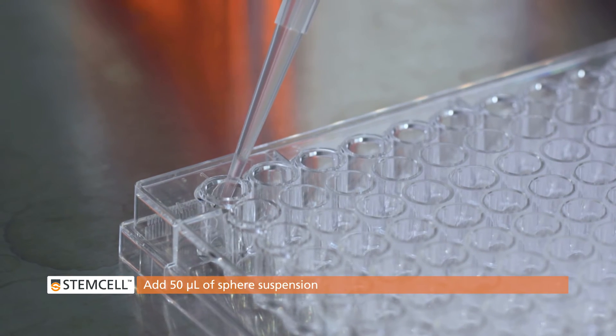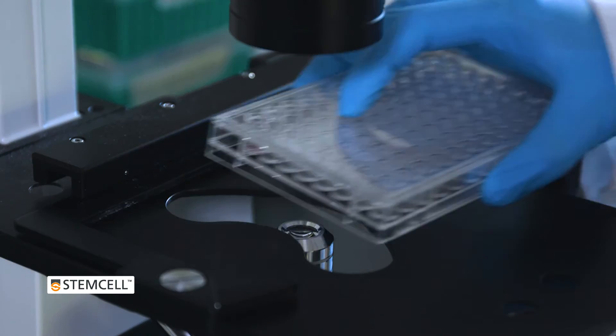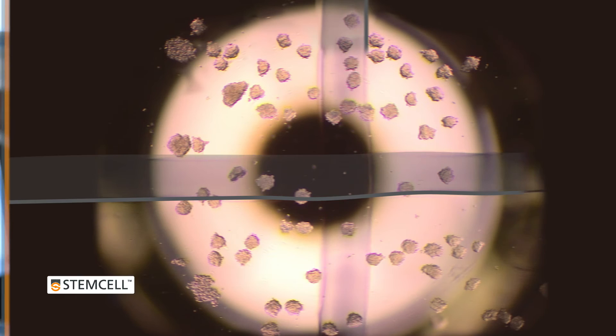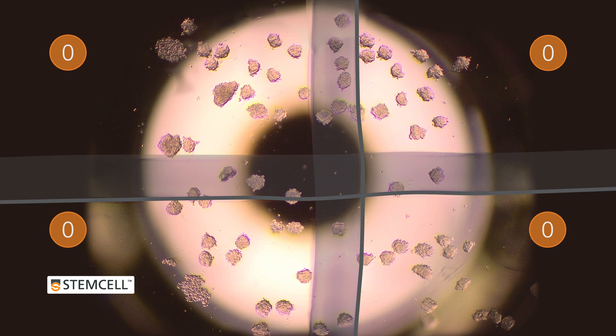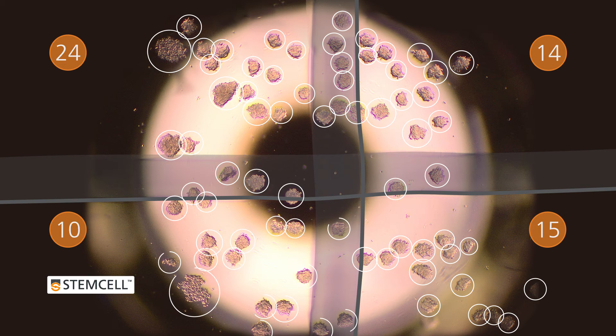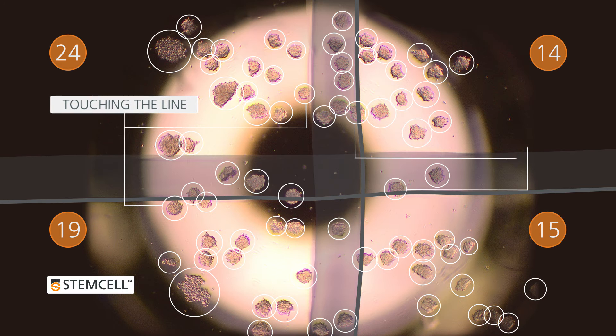Add 50 microliters of the suspension to the well and view the spheroids under the microscope. Carefully count the spheres in each quadrant before moving to the next. Be careful to avoid double counting spheres which are touching or on the line.